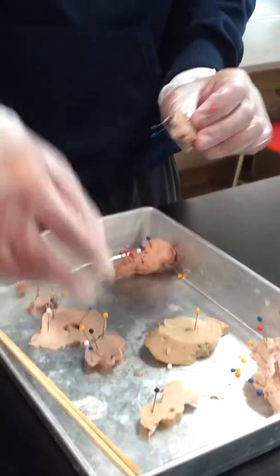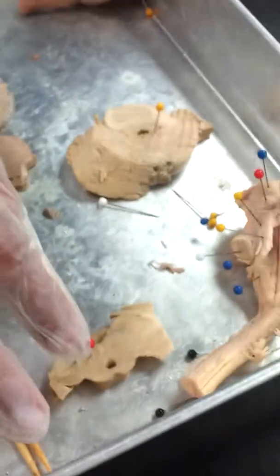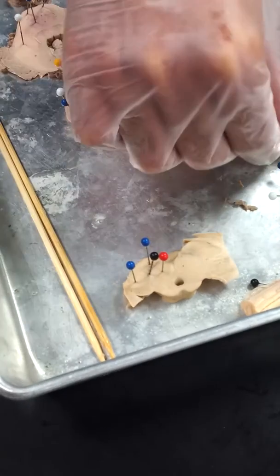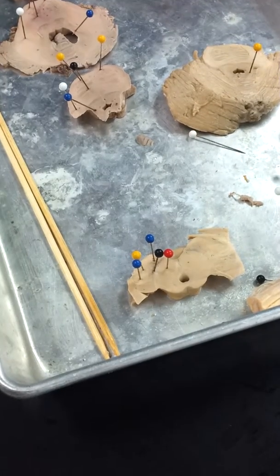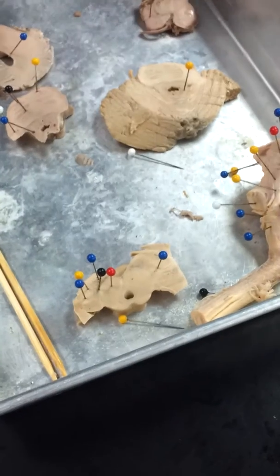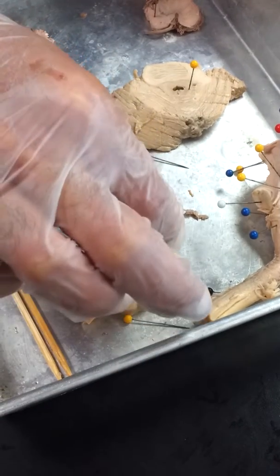Just turn it over. This one's on this side, but I just use this one instead. This one you see the red nucleus. Substantia nigra is painted in black. So you'll see crus cerebri again from here. Here, this would be 100% corticospinal tracts in the middle. So I do the same thing again on the other side. And here, 100% corticospinal tracts.